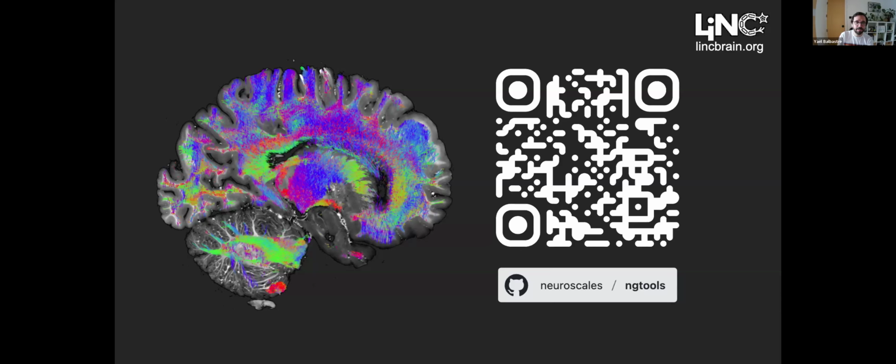Good question. It's really the size of the data. One of the labs comes from the MRI side, and by moving to ex vivo imaging we work with larger and larger images, but still not to a size that needs something like Neuroglancer. But now we are acquiring those X-ray data sets that can't be loaded in memory at once.